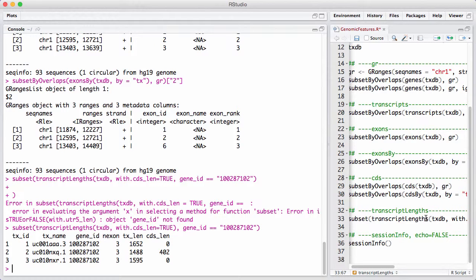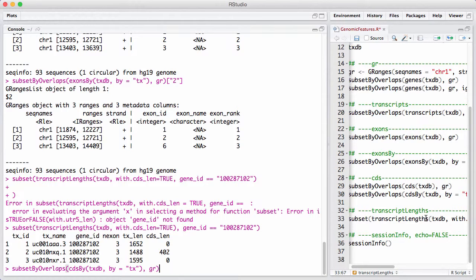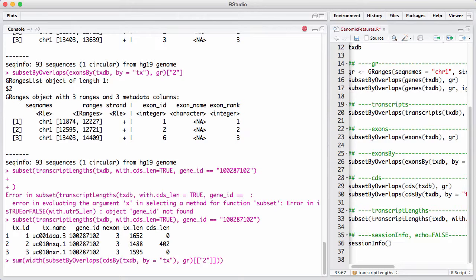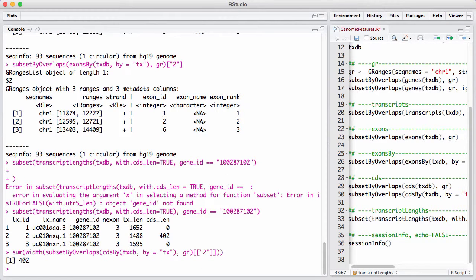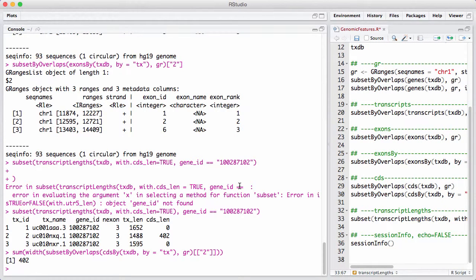So here we see the three different transcripts. We see that each of them have three exons. We see they have different lengths because they are spliced differently. And we see that two of the transcripts have a cds length of zero, which basically says that there's no coding sequence inside those two transcripts. And the last one has a cds length of 402. I think that those 402 bases are, let's see here. Let's say sum with, I'm checking, I get 402 bases nucleotides out when I look at the coding sequence.